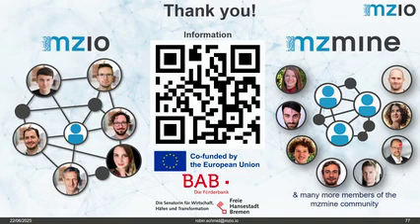But then mzML also has some support for IMS data, but that is kind of just plugged on top of it, and not every tool will be able to actually read it. The file size gets smaller. They collect all of the IMS in one scan or something. It's kind of a weird format, honestly. Steffen had to implement the support at some point.